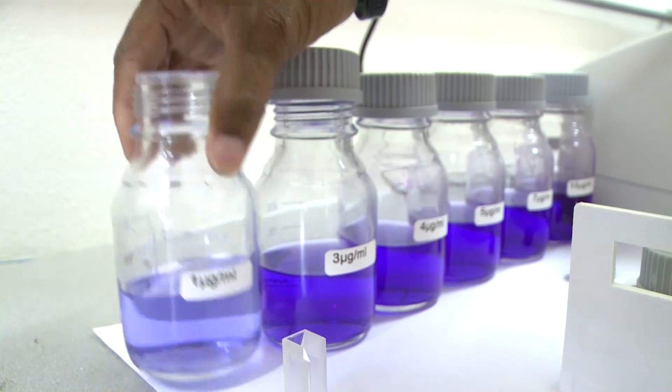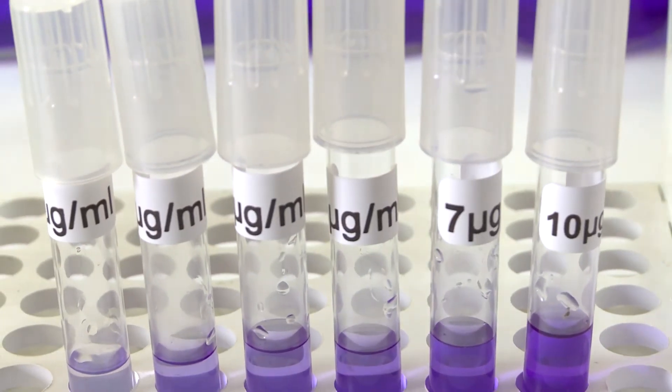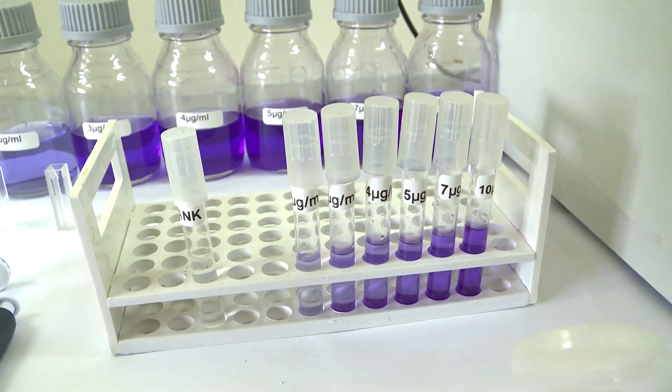After our simple experiment, you should have an understanding of how the spectrophotometer works. We started with a blank of just water and a series of tubes going from 1 microgram per mil of crystal violet through to 3, 4, 5, 7, and 10 micrograms per mil. Having seen the readings taken, you can see that the absorbance increases. In other words, the more particles within the solvent, the less light passing through the solution, and as a result, the higher the absorbance reading on the spectrophotometer.